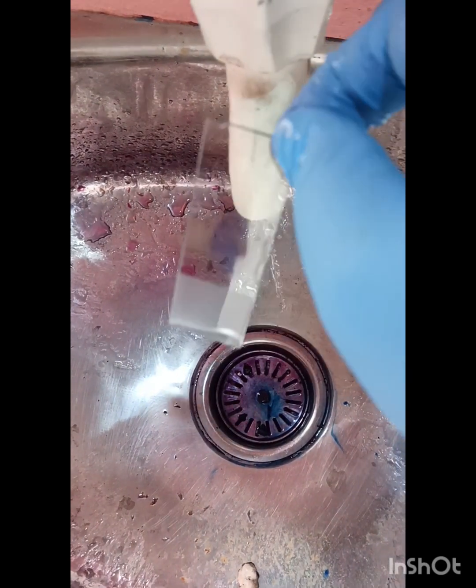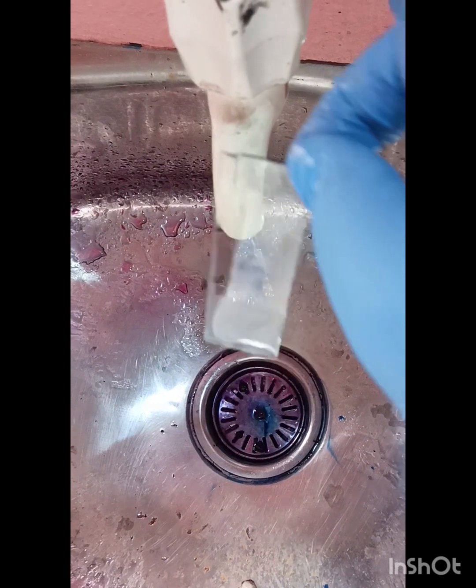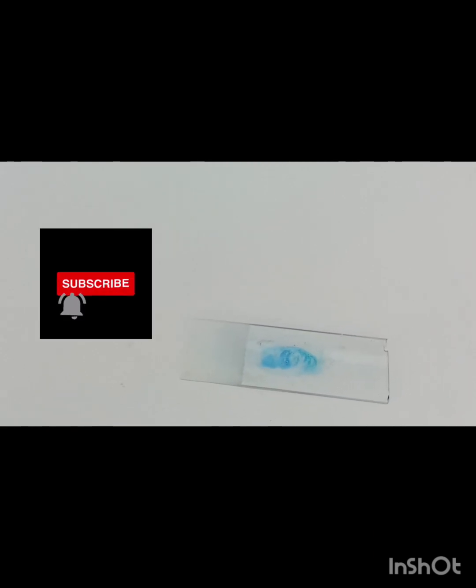After washing, allow it to air dry. Complete the air drying. Now we see it: the smear will take a bluish color from the methylene blue counter stain.